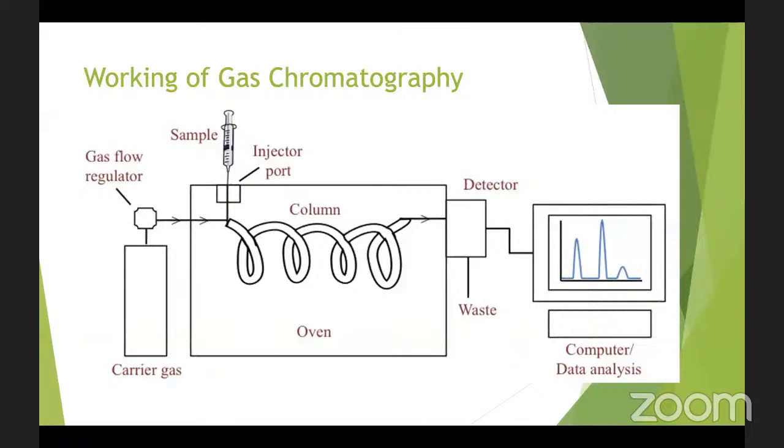I have a question, sir. In gel electrophoresis, after getting different bands, we use a nitrocellulose membrane to take out the band of interest. But in column chromatography, how do we select our region of interest?